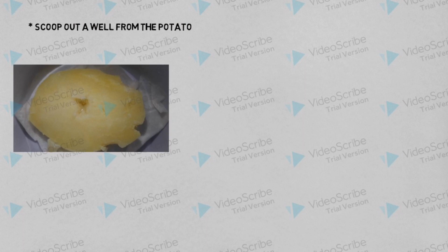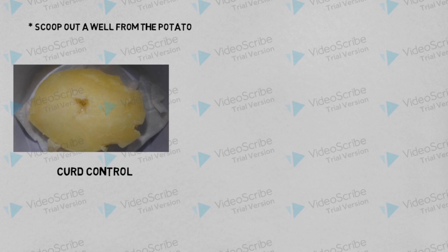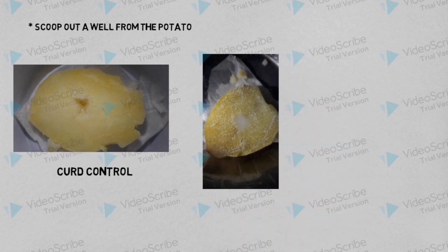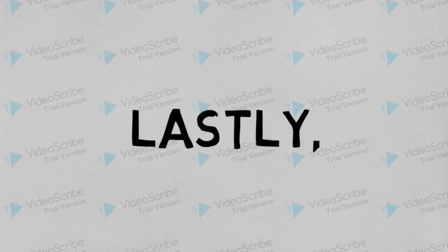In total, we make 4 bowls, namely curd control, in which we add 0.5 ml warm water, antibiotic control, which consists of 0.5 ml antibiotic stock solution with no curd, and other 2 bowls with different concentrations of antibiotic stock solution, 0.2 mg and 0.5 mg. Further, we seal them up and keep them aside for 24 hours.